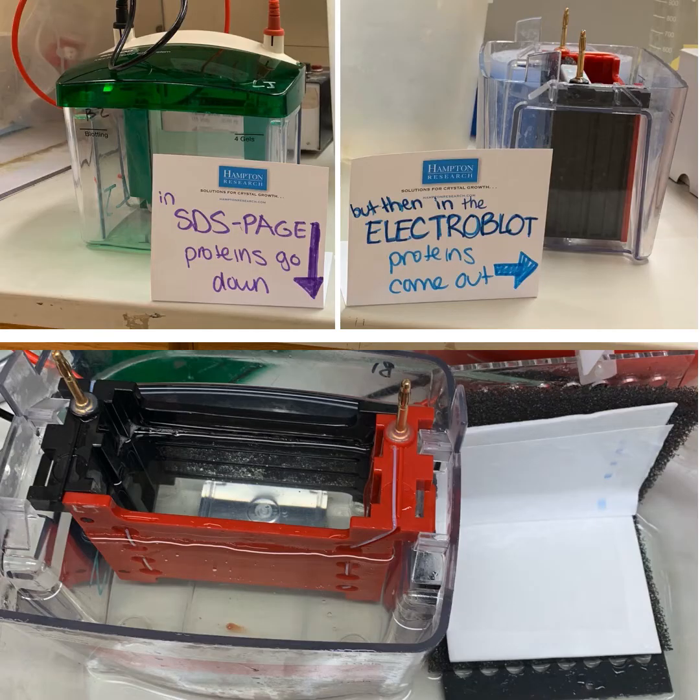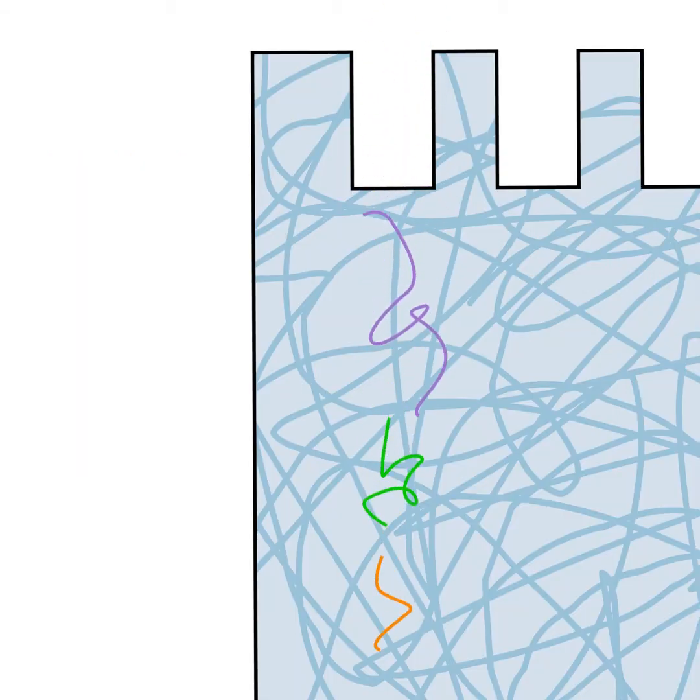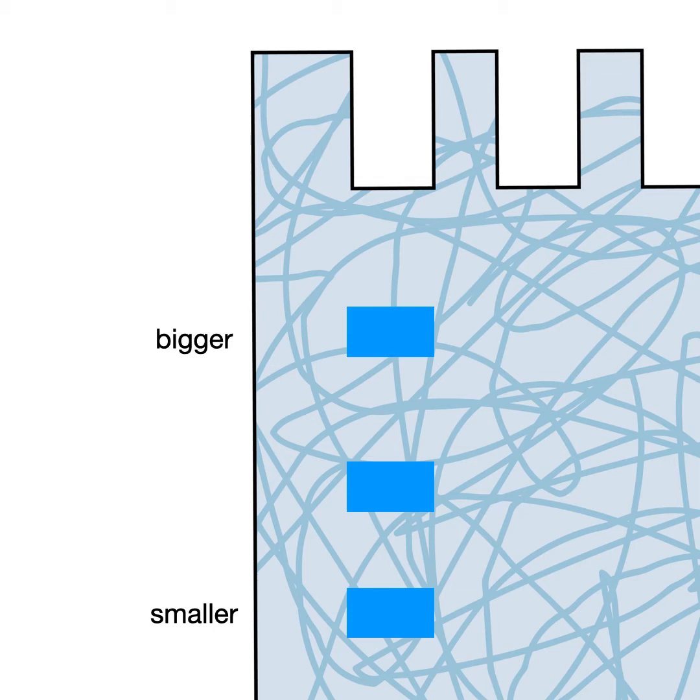So basically, in this first step in SDS-PAGE, we're sending the proteins traveling vertically through this gel. And you can see in this picture that they're separating by size. So basically what happens is the proteins are going to get tangled up in this gel mesh. And the longer they are, the more tangled they're going to get, and so the slower they're going to travel.